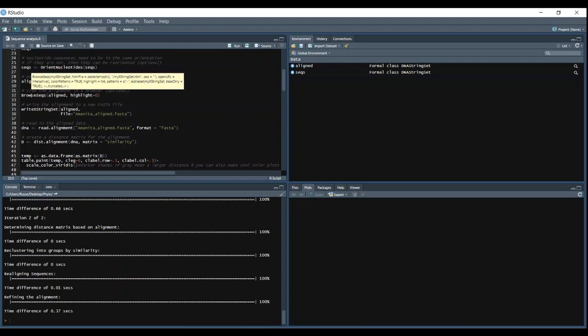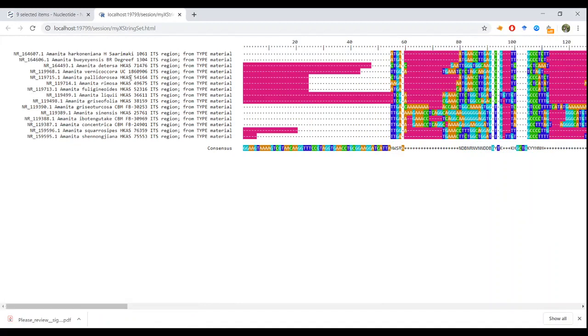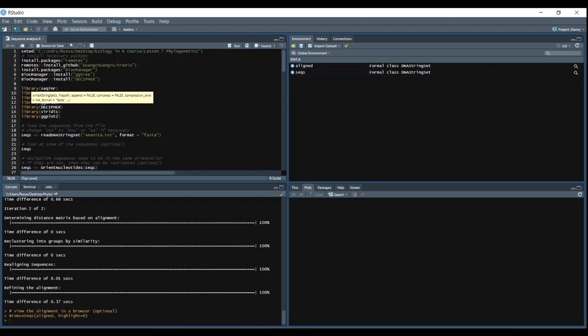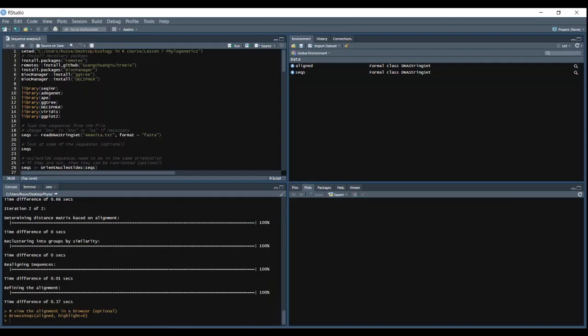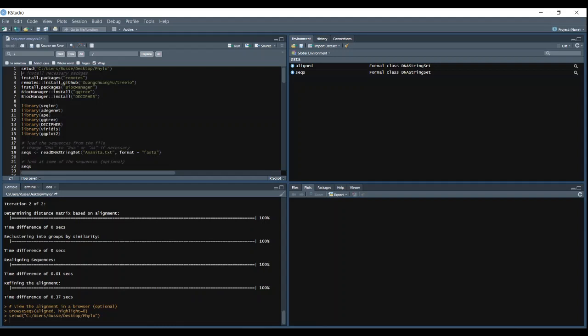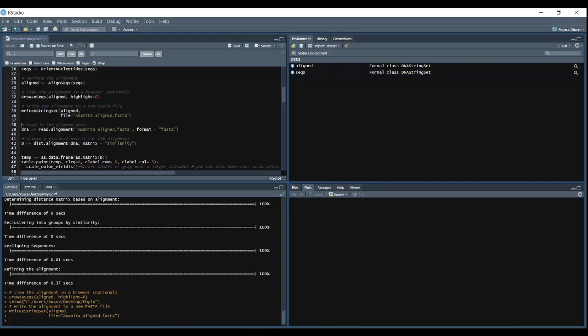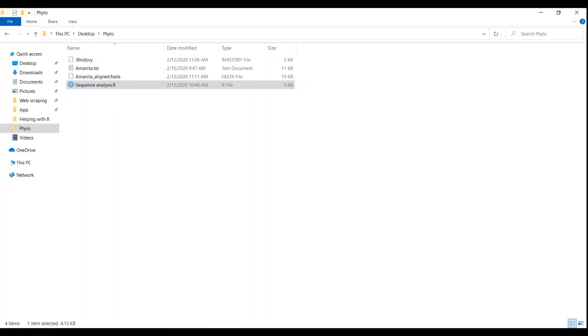We can browse our sequences in the browser, so this will open it in whatever browser you use. And then we can check out all the gaps, similarities, differences. And then we'll write the file using writeXStringSet to our data frame. I just want to reset our working directory to a new working directory. Change the backslashes to forward slashes. And then run that. Okay, so we'll run this. And now we should have our Amanita aligned FASTA file in our working directory.